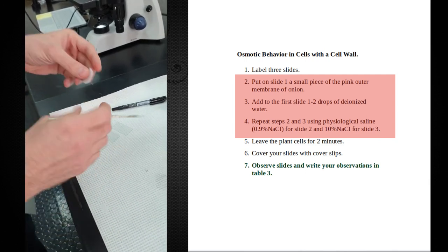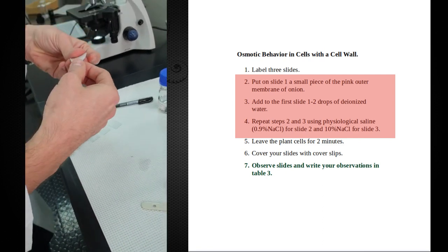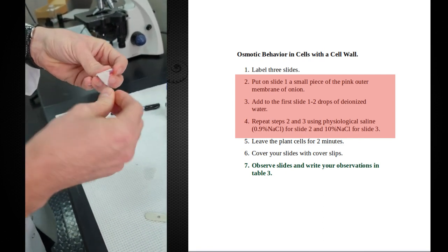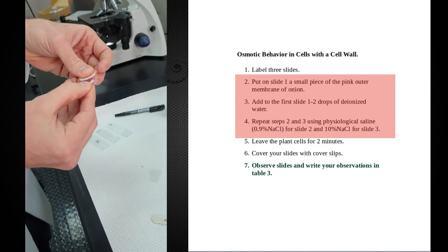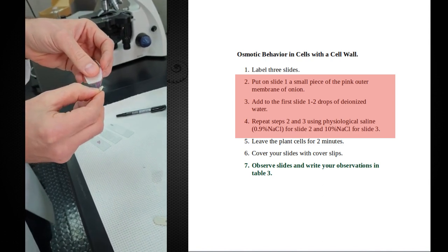Okay, I'll drop off another one. Again, break it and then pull. You can see it's separating again.